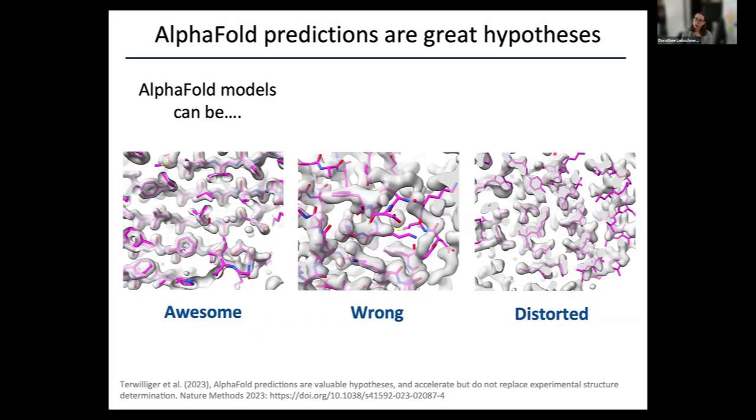So especially let's look maybe at this helix here, right? This clearly is a density that has helical shape. We see that the protein chain has also a helical shape, but it's a little bit displaced. And I think also the helix in density is a little bit less squished in. So the model has slightly different geometry. So there is a distortion.